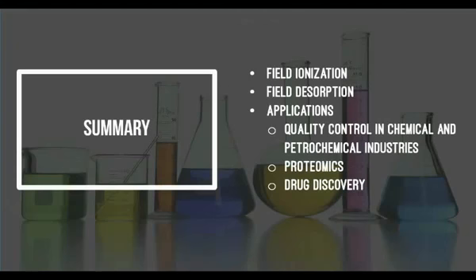We've come to the end of our video. To summarize, these are the things we went through previously. We discussed field ionization and desorption. We also discussed several applications of mass spectrometry in 3 different fields, namely in petrochemical industries, proteomics, and in drug discovery.